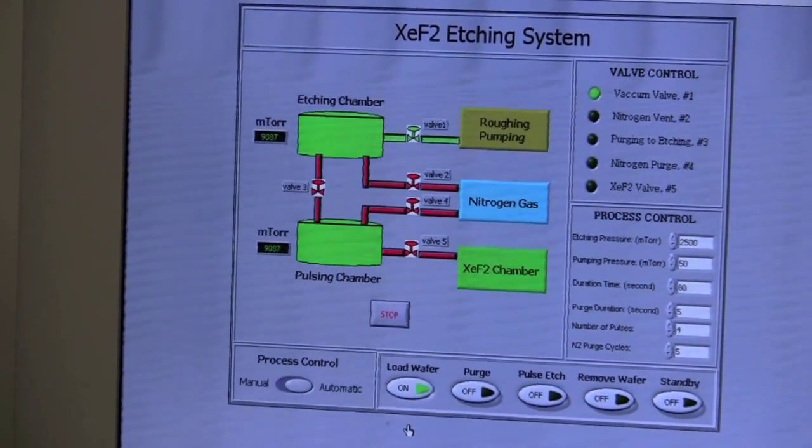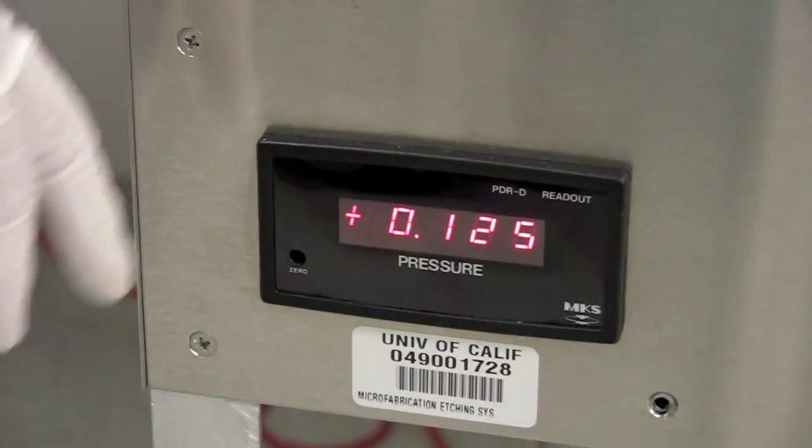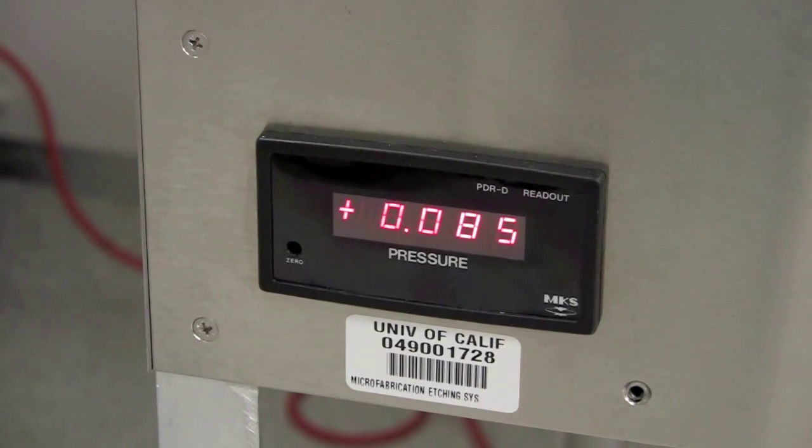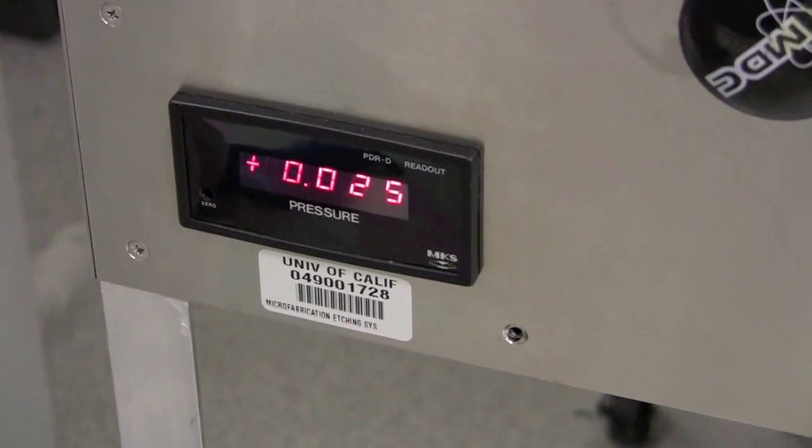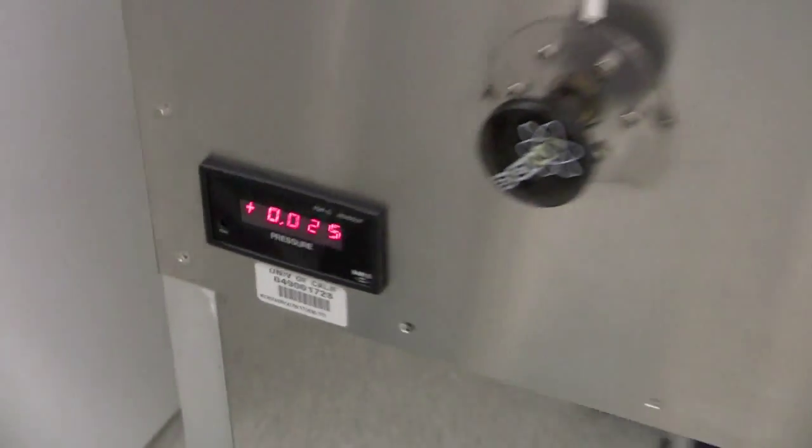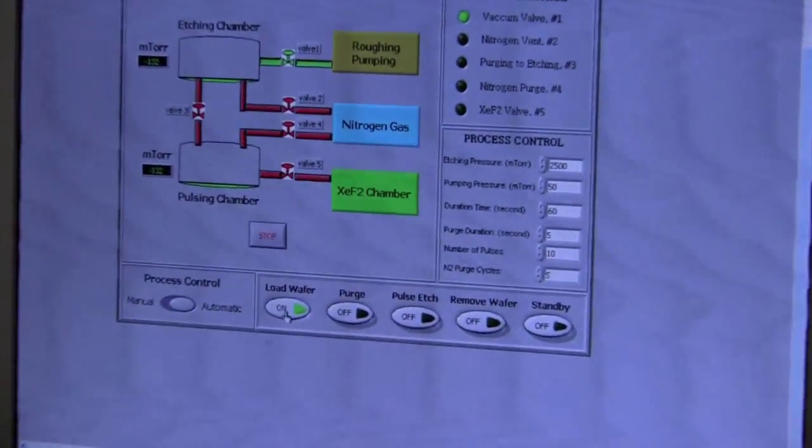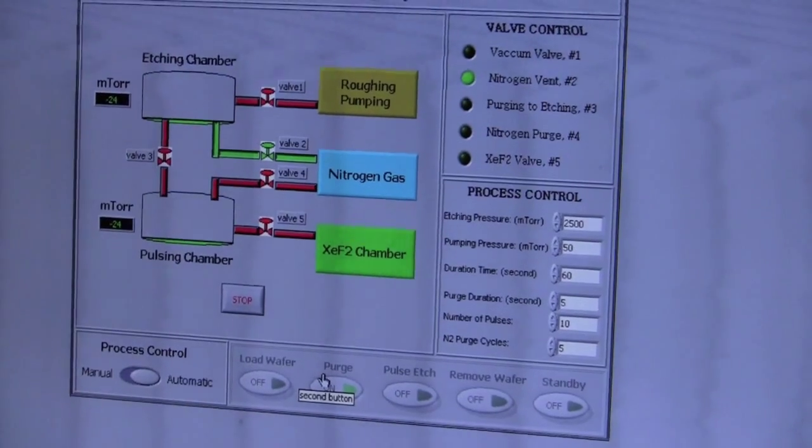Immediately, you'll see this transducer in front jump up and then it should jump back down. It's going to start going down, it levels off around 28 millitorr, but you don't have to wait that long. You can just wait until 50 millitorr. Once we hit 50 or less, we can go ahead and start purging our sample chamber. On the screen, you'll see this purge button here. So we hit it and it'll begin purging. While it's purging, I'll explain how the system works.